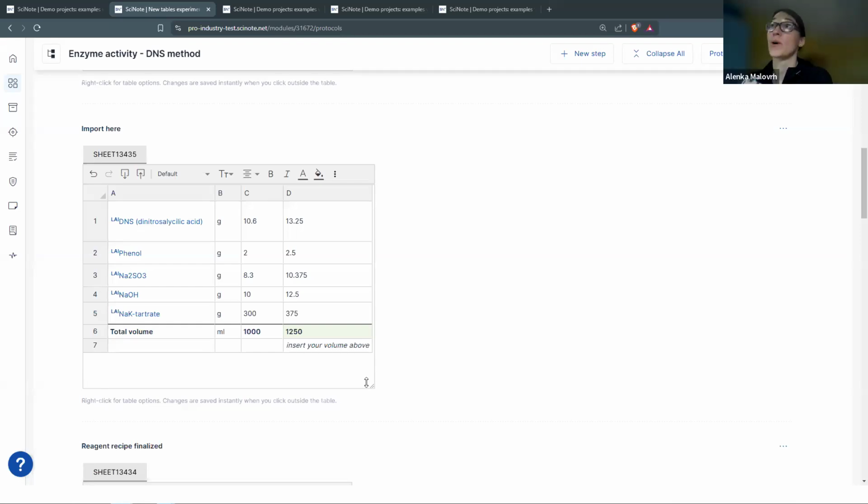Yeah, maybe to add to this, it depends a bit also on the size of the table. We showcased only small ones today. So if you're using larger ones with multiple columns or rows, maybe come back to us with your use case so that we can double check on that. As I said, there might be some cases where the behavior is not yet ideal, and we are happy to look into your use case and see what we can do to improve it.